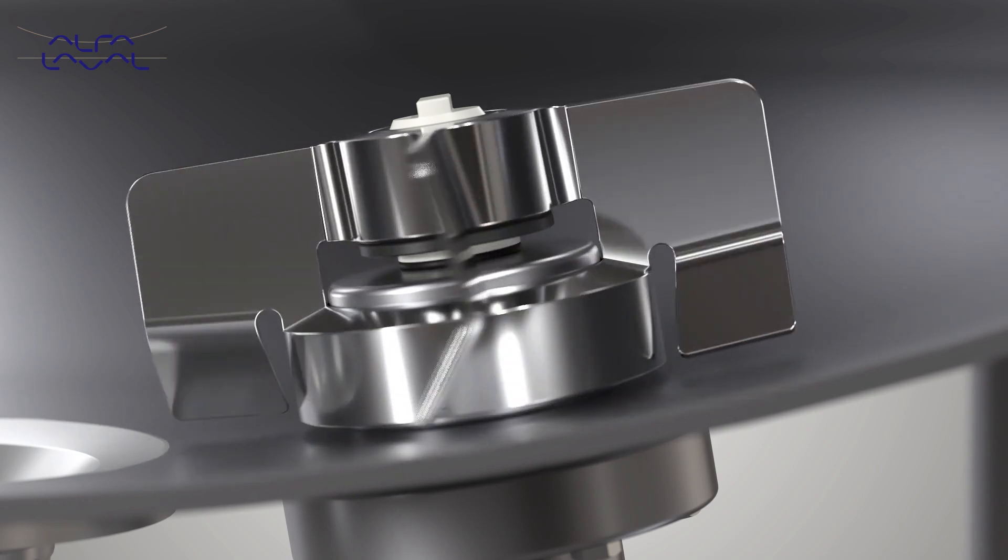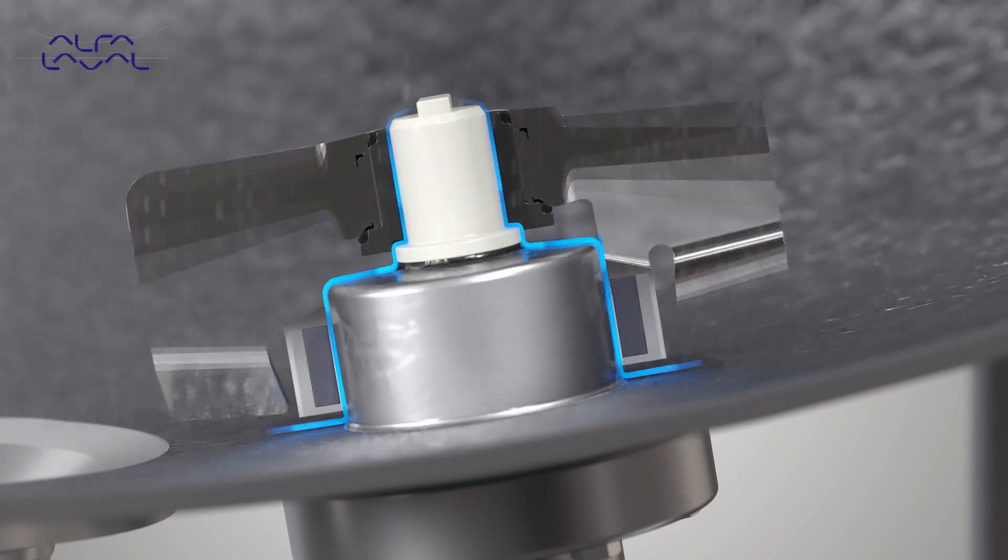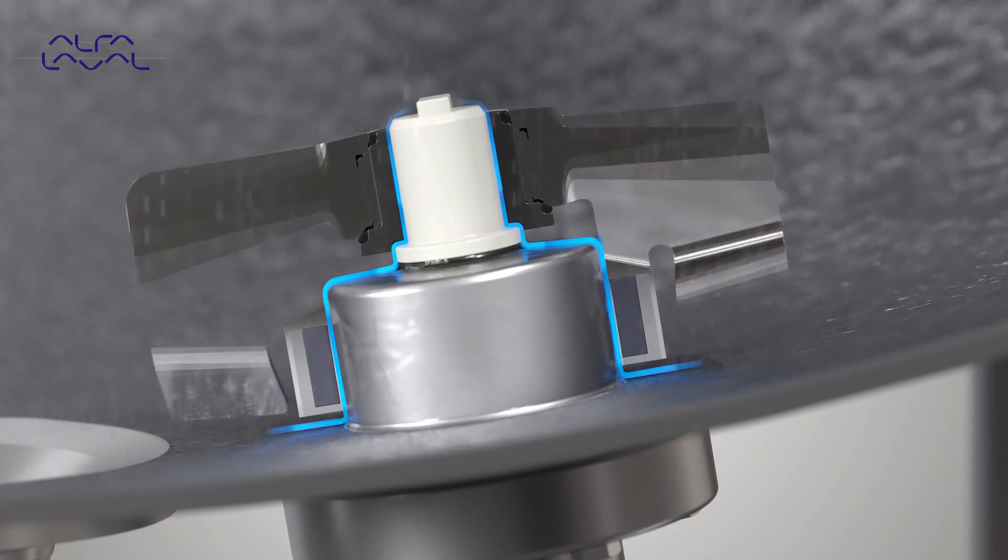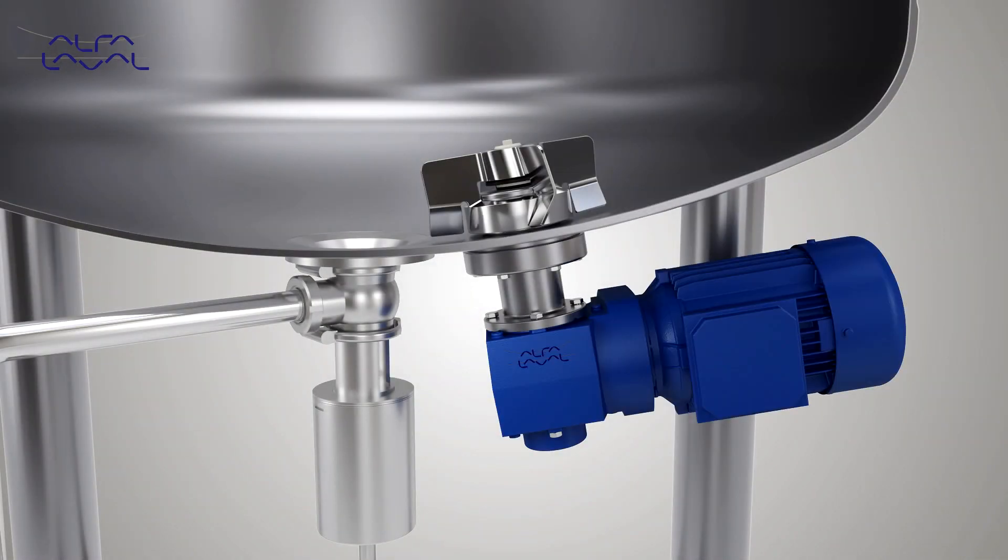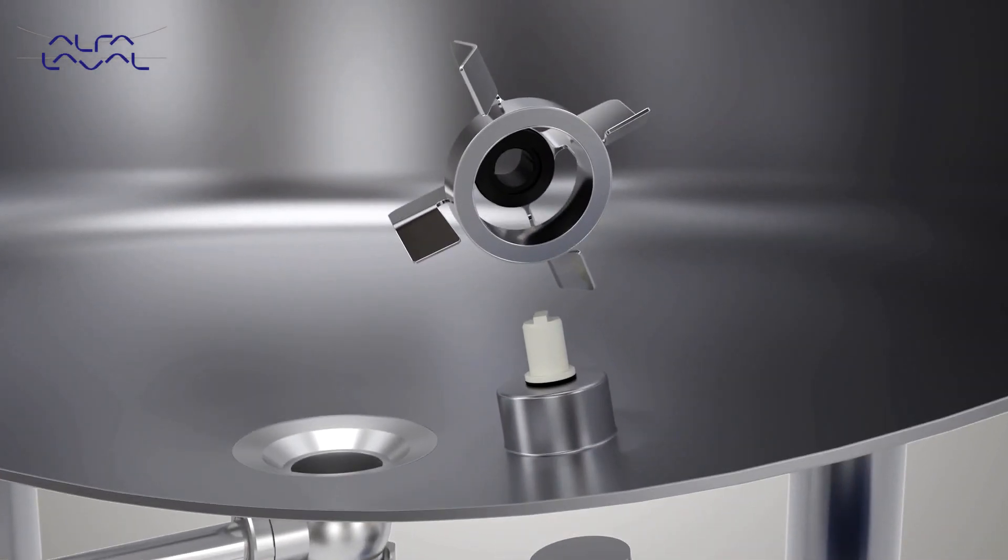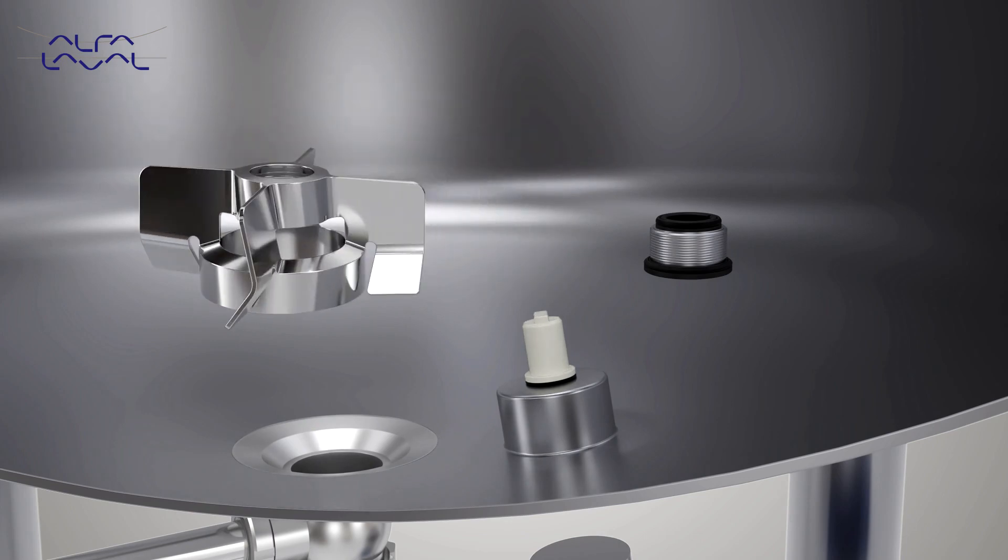unit easy to clean. Cleaning in place can occur while the mixer is running. The ease and convenience of servicing the Alfa Laval LeviMag is a big advantage. Levitating bearings help reduce costs, improve product safety, and boost uptime.